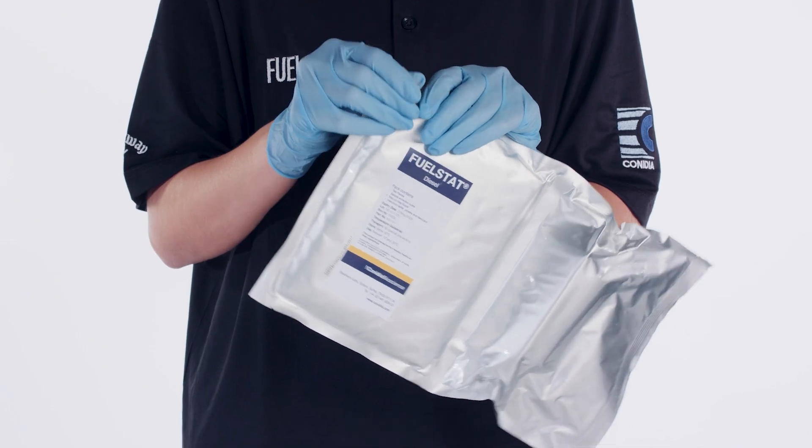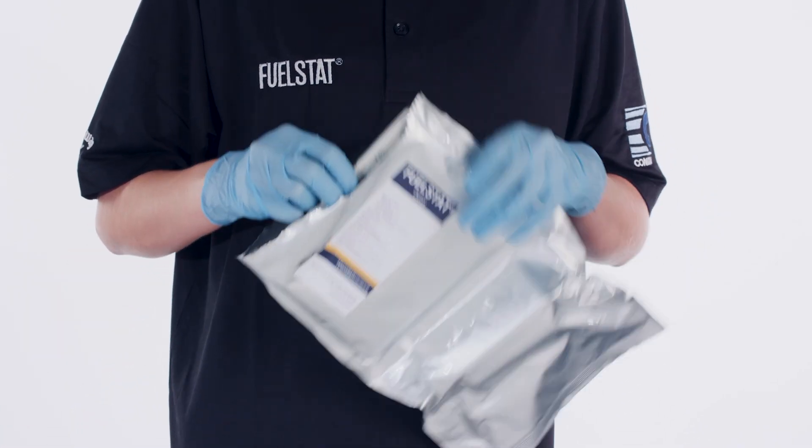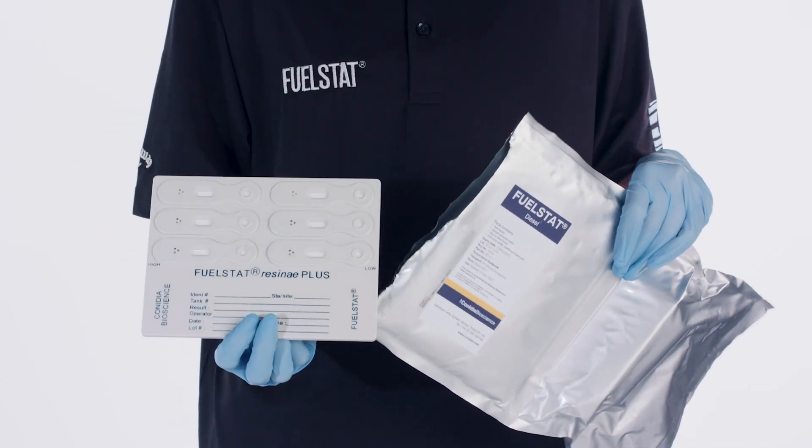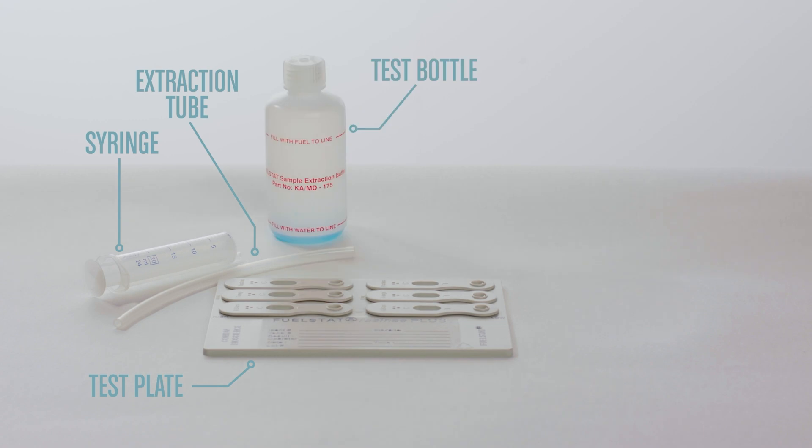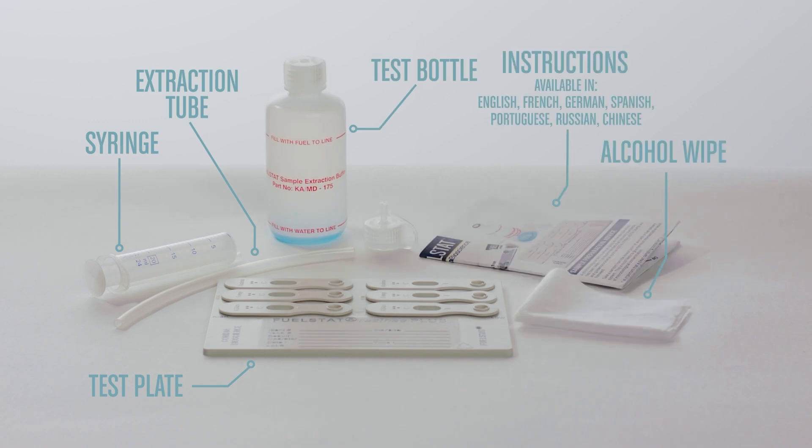Do not open the test kit until you have a sample ready and are ready to test. Each kit contains one test plate, a syringe with extraction tube, a test bottle, an alcohol wipe, and instructions. These instructions are available in multiple languages.